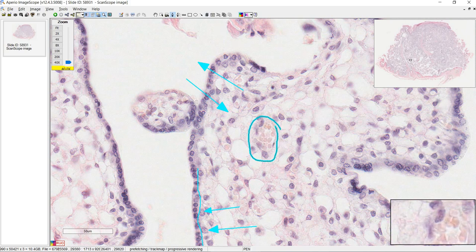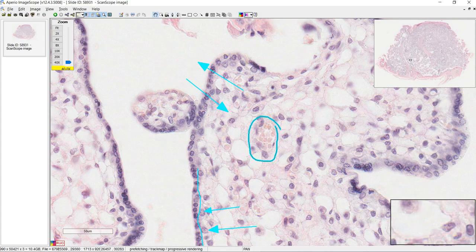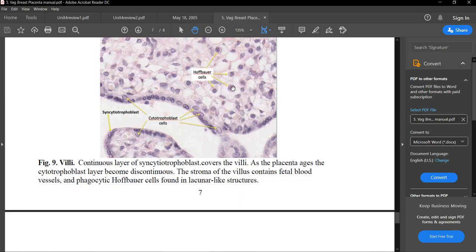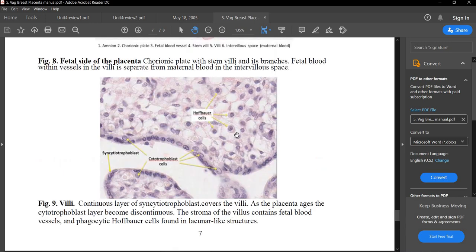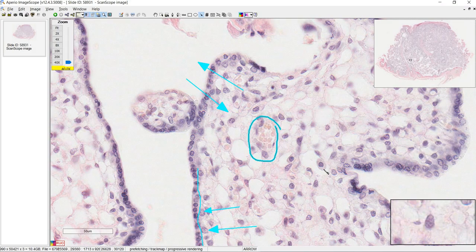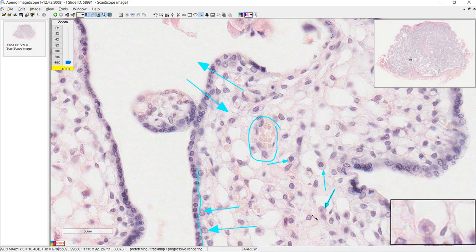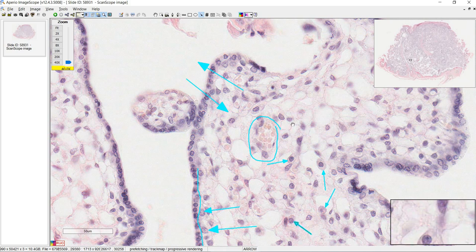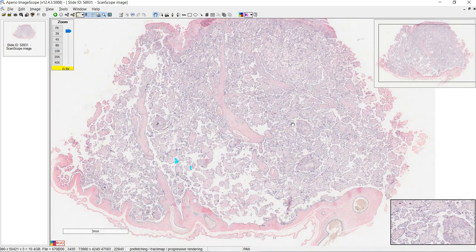Here we can see one of the blood vessels with red blood cells in it, along with some endothelial cell nuclei. Another thing to notice are the Hoffbauer cells — these are fetal macrophages. When looking for them, just look for something that looks like a fried egg sunny side up, with the nucleus as the yolk. It looks like we have a few Hoffbauer cells here. That's it for this video — good luck on exams and let me know if you have any questions.